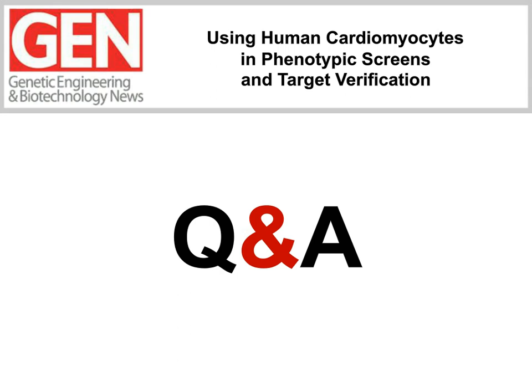So we selected BNP because it's a typical marker that's used in the clinic for hypertrophy. But as well, we had compared BNP and ANP early on, and we felt BNP was the more robust marker in the assay. Okay, to the point.